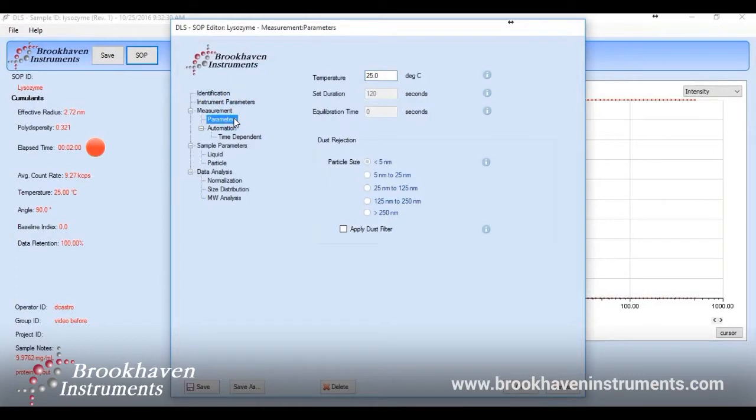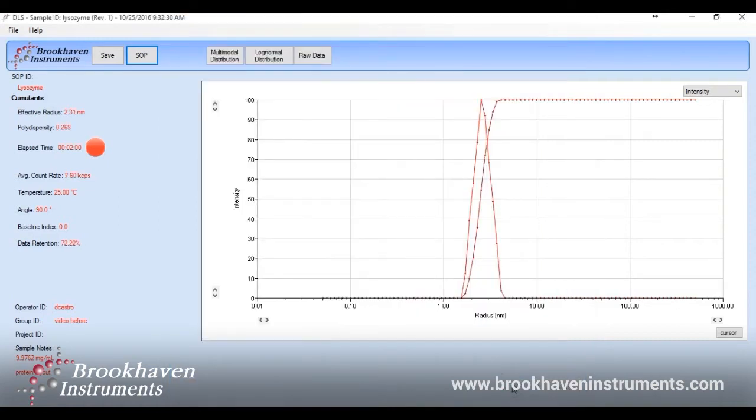under parameters, you'll see we have a dust filter setting, which can be turned on and off, and you can choose the appropriate setting based on the expected size of your sample. If less than 5 nanometers is chosen and the filter is turned on, some of those fluctuations from dust will be eliminated to allow for the desired particle size to be measured.